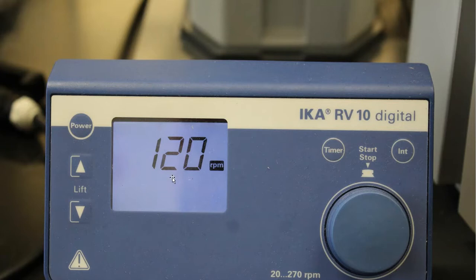It rotates the flask, rotary evaporator. Go figure, who would have thought?